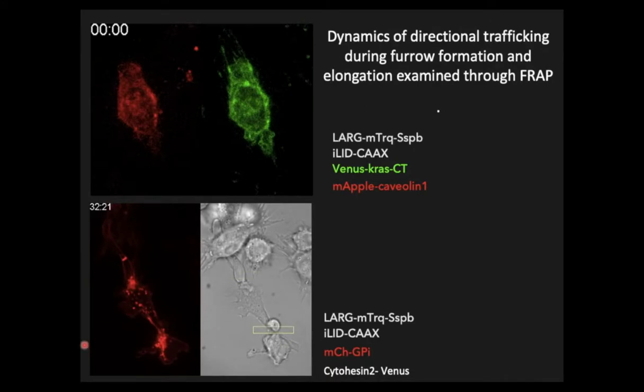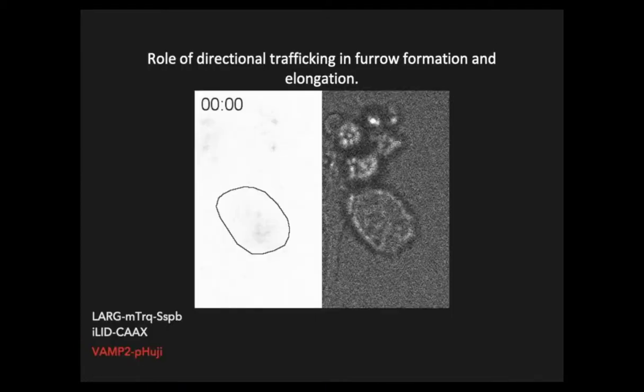in the intercellular bridge. Next, we use total internal reflection fluorescence, TIRF, which is ideal for visualizing events such as exocytosis, which occurs at or near the plasma membrane, around 100 nanometers above the substrate. And we combine TIRF and optical control to see more clearly the exocytosis, and we use VAMP2, a protein involved in membrane fusion.